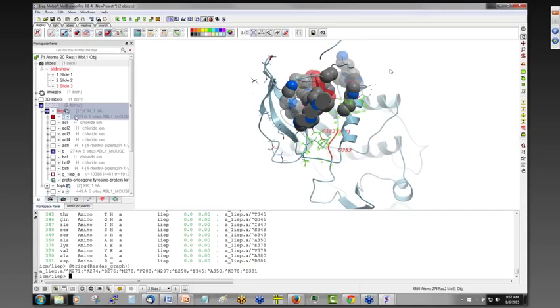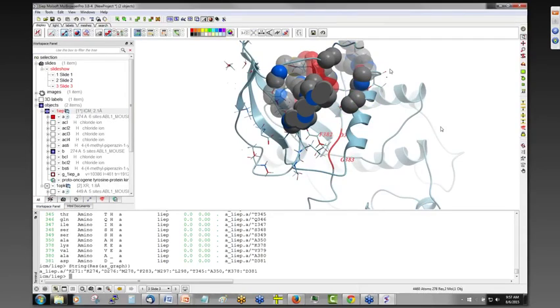As I mentioned at the start, we had a very small bug in the very latest version, which we fixed, and I'll send you the new link with the follow-up email along with the video. But the Mac, Windows and Linux versions are exactly the same. You should see the layout, but in the Pro version, I don't think you see the tools button.